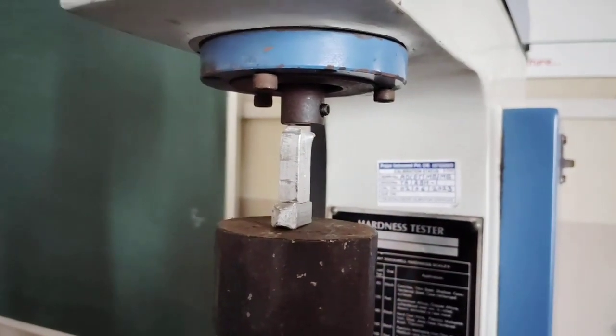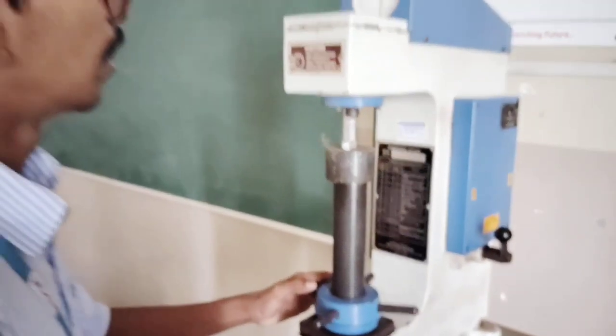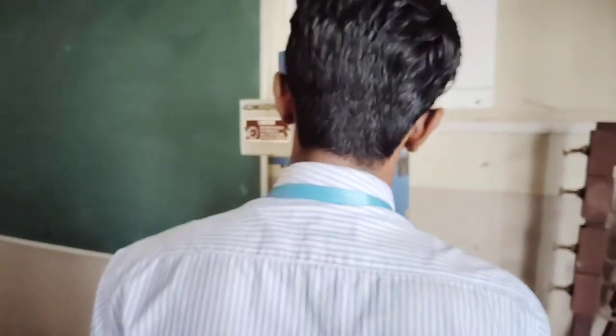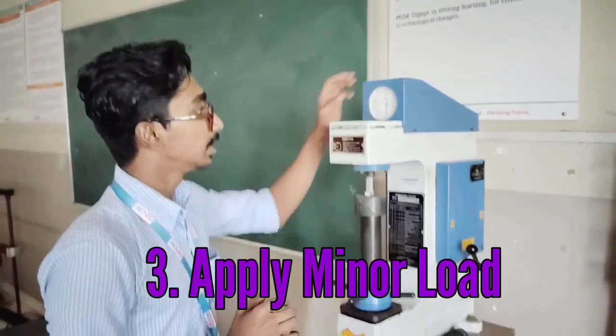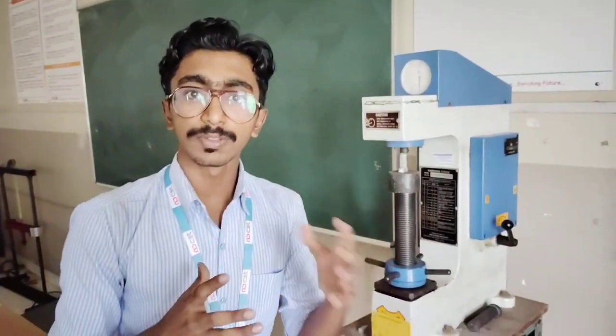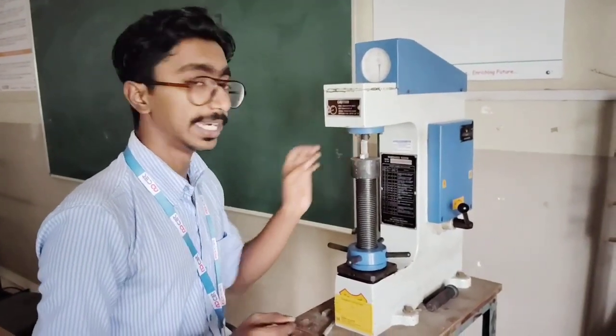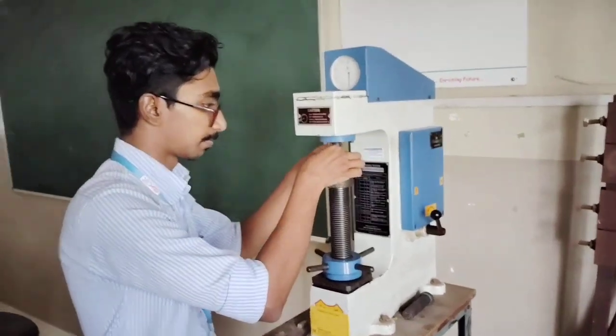After this, first I will apply a 10 kg minor load. Because of the 10 kg minor load, a small indentation will occur in the aluminium test piece.